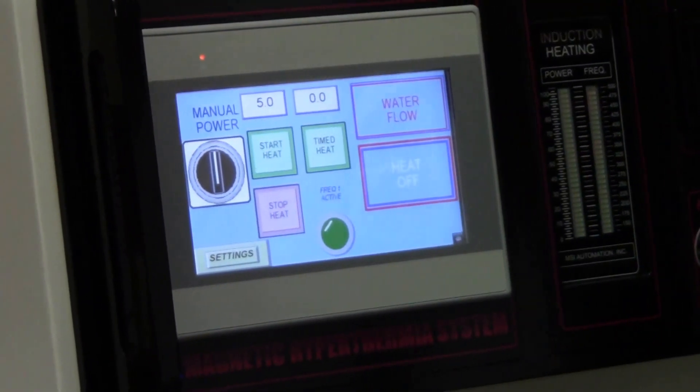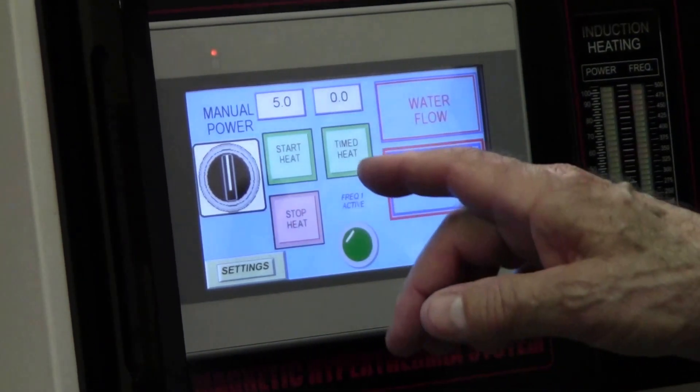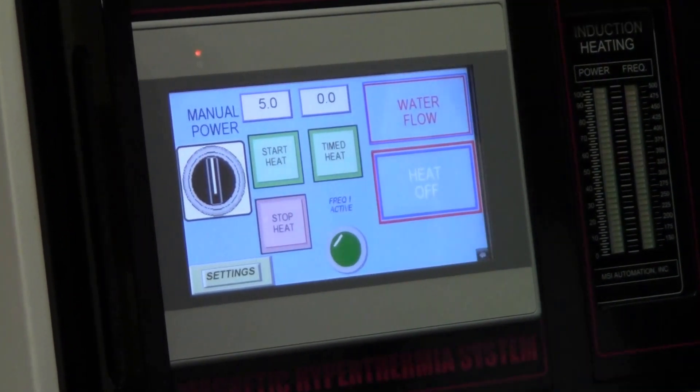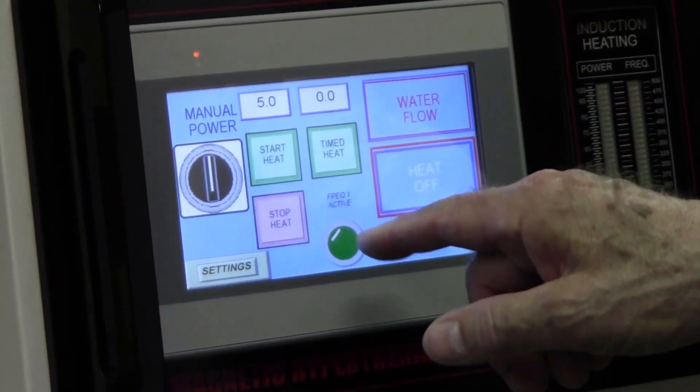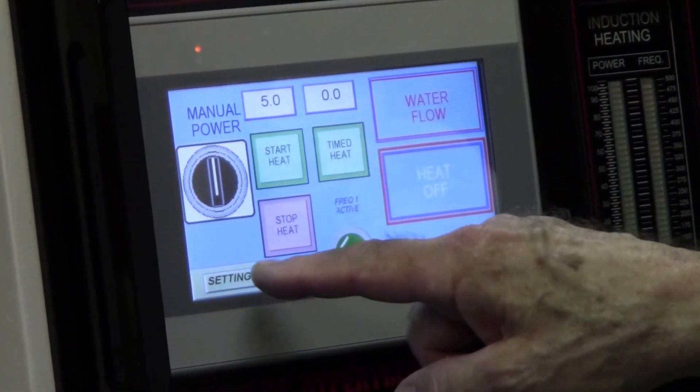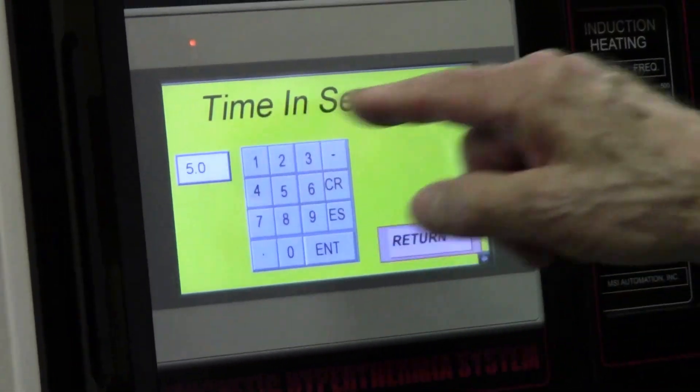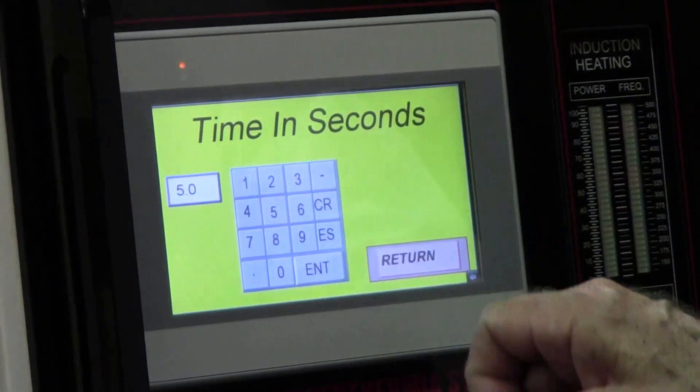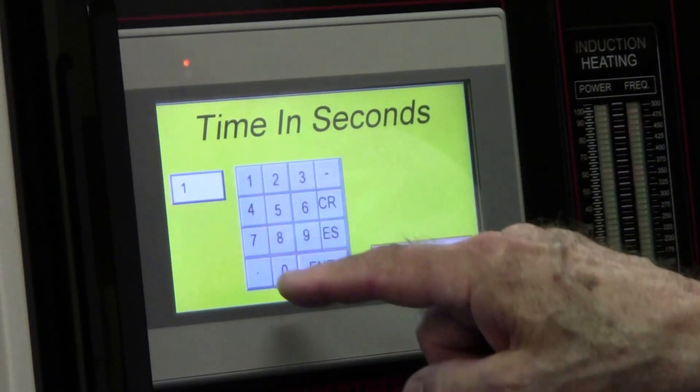So I'll push the selector switch and now we're in manual power. Now the screen itself has a built-in timer, so you can do timed heating. This is time in seconds. Right now it's set for five seconds. I'll change it to ten seconds.